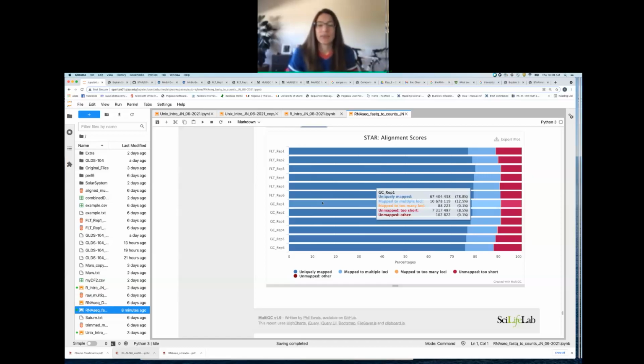Yeah, so again, we're seeing a nice tight spread of the multi-map locations. However, we're still seeing for all samples have at least 11% or more of their reads are multi-mapped. That's quite a bit, right? Like 1 in 10 reads are multi-mapped. So are we going to throw that much information away? Like, what are we going to do with those? Let's find out. Before I move on, any other questions about what we've done so far on the Jupyter Notebook?